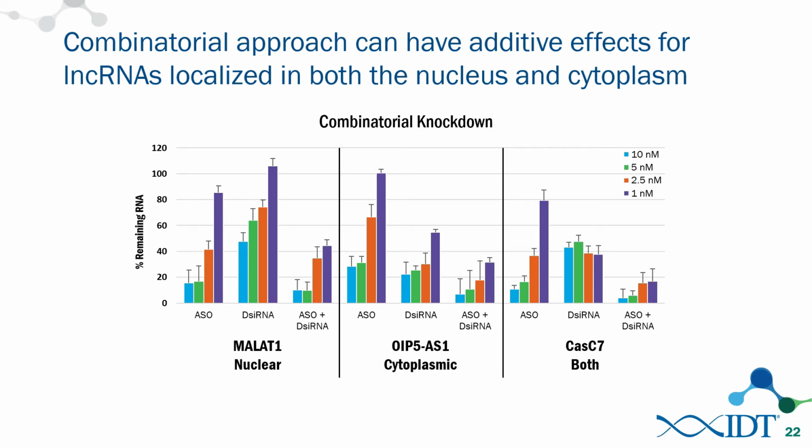And what is the time point for the knockdown? 24 hours. Are they all 24 hours? They are 24 hours. I also did them at 48 hours, and I got the same results.